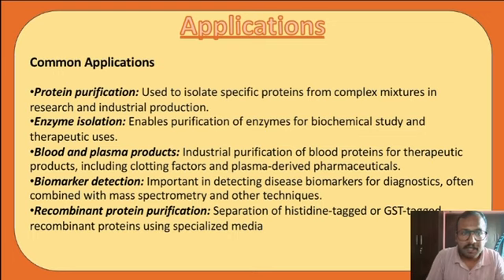Applications. Common applications are protein purification, enzyme isolation, where we do the immobilization of enzymes, and separating clotting factors in blood. It is also used in detecting biomarkers during disease diagnosis and is also used in recombinant protein purification.